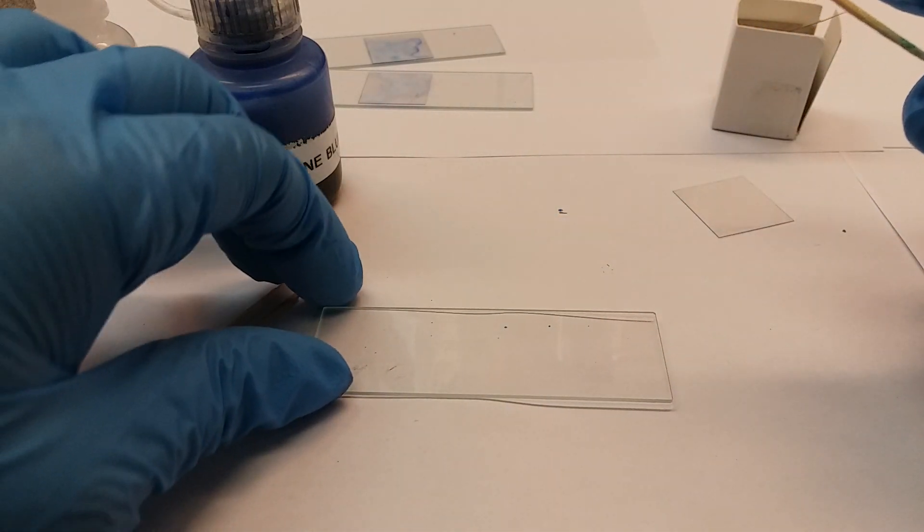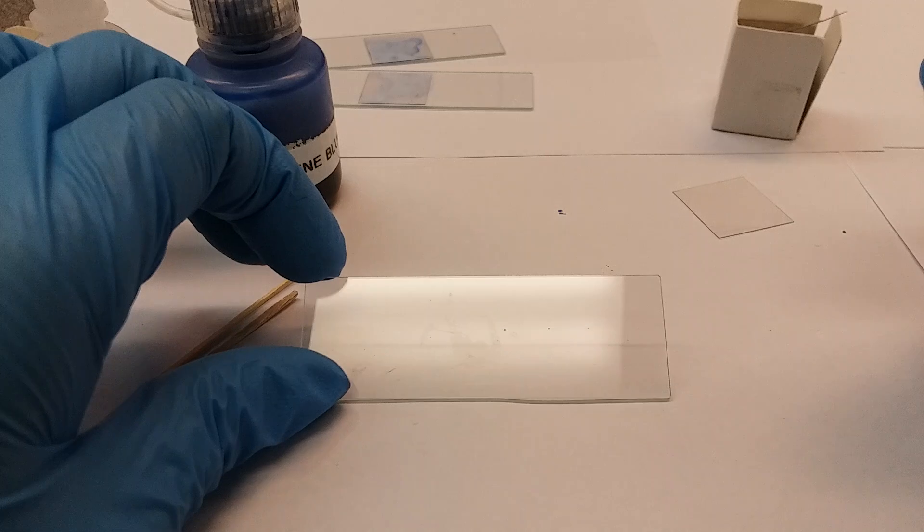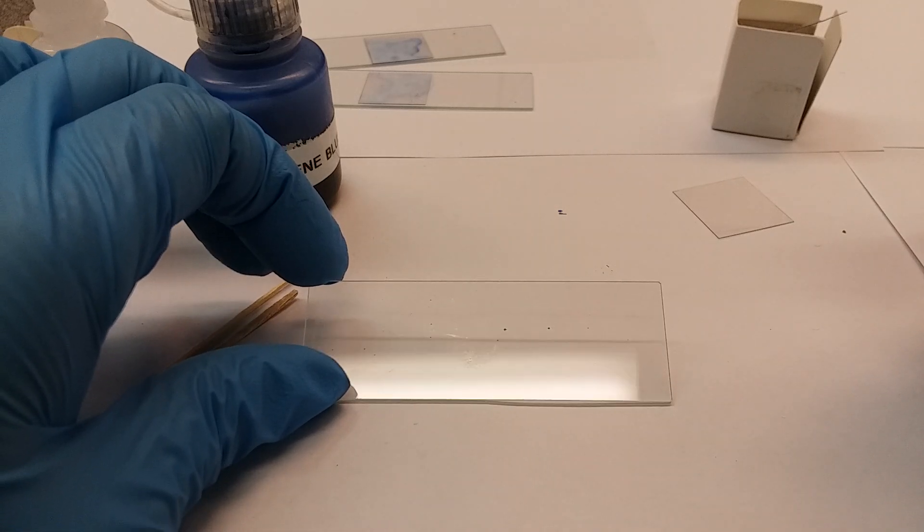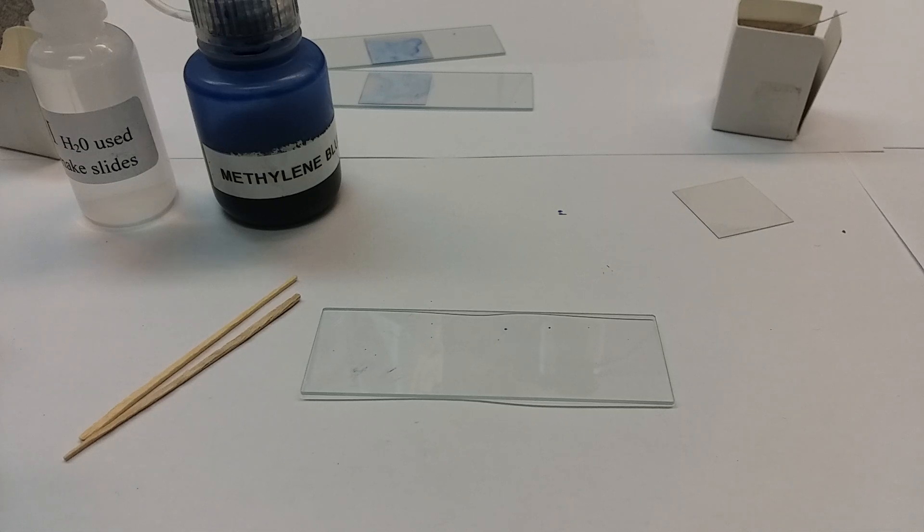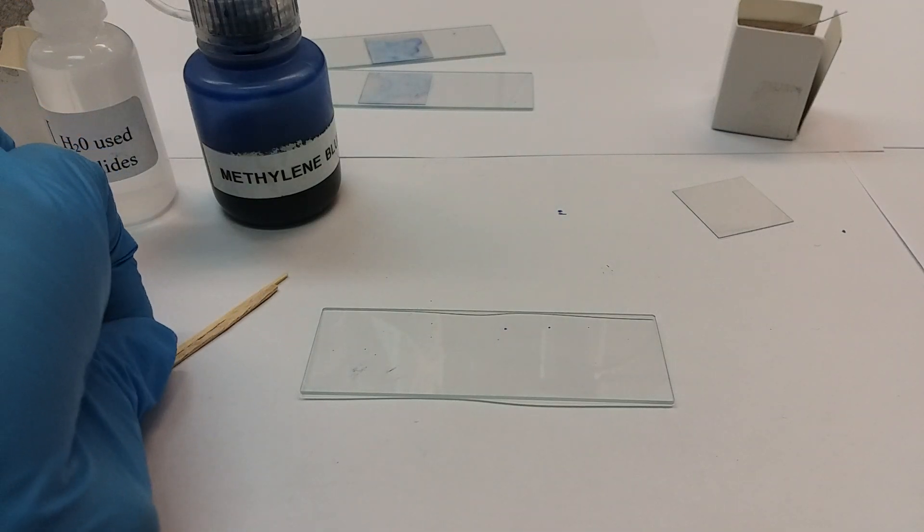I'm going to rub my sample right here on this slide, and you're going to notice a shimmer, a sheen. That right there is what you want - it looks like spit, that's okay, that's perfectly normal. So this one's dirty now, I'm going to put it over here.